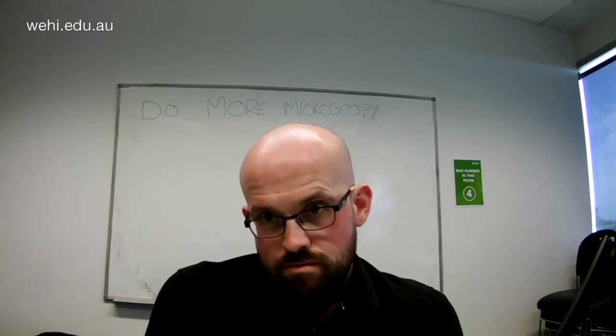Alan Kalman asks: great talk, Niall, especially the second half. Can you label the red blood cell cytoskeleton during invasion to see the local disruption as the parasite interacts and moves into the red blood cell?